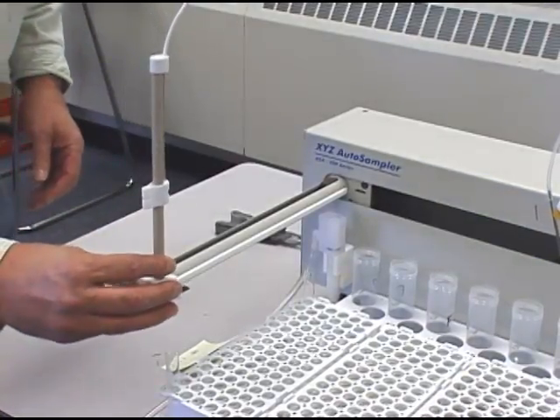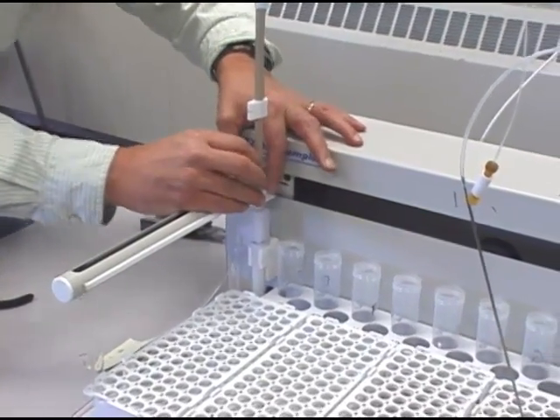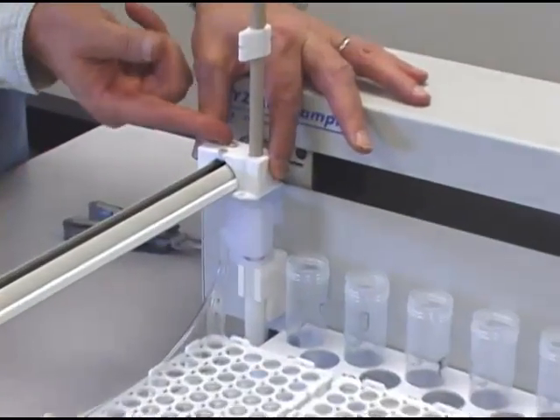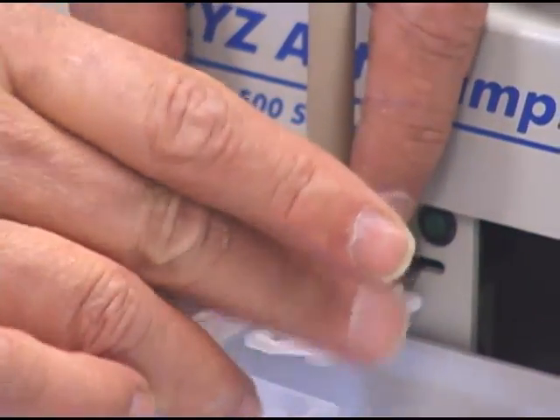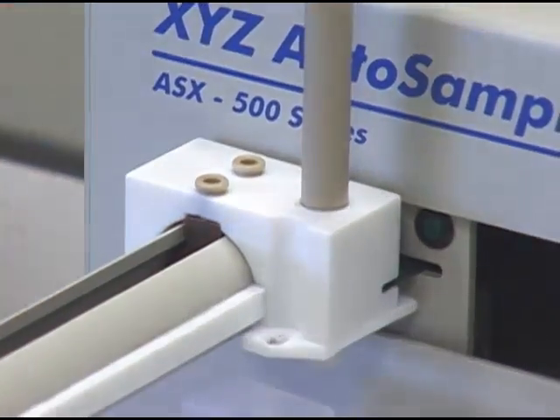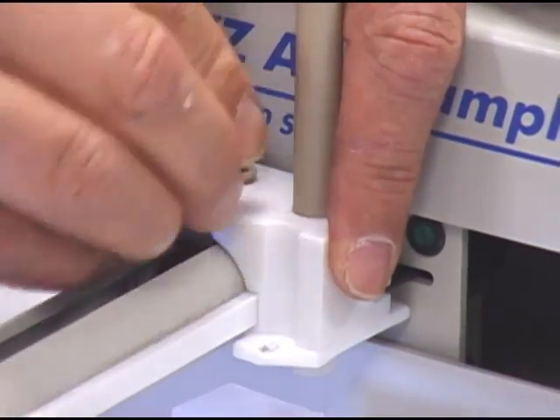I'm now going to replace the slider back onto the Z-Arm. When you bring it down towards the end, you may have to lift these bushings up a little bit to get them onto the block.